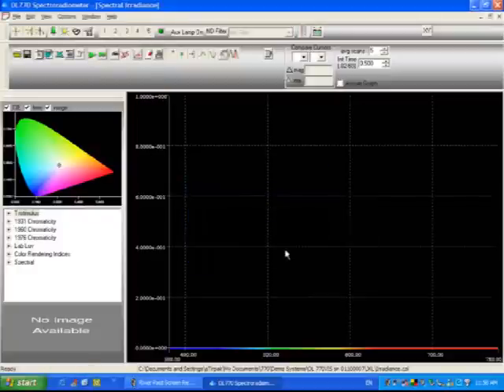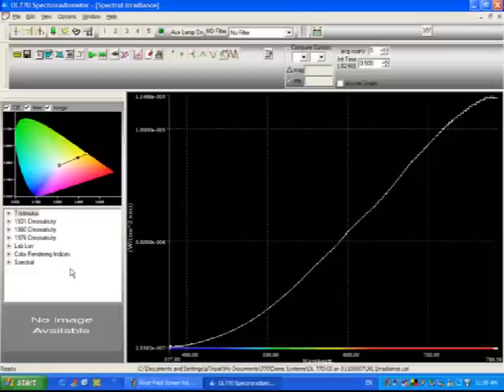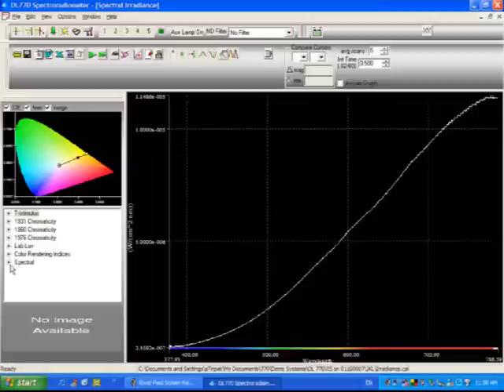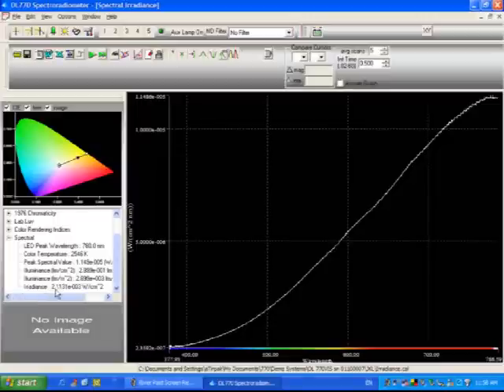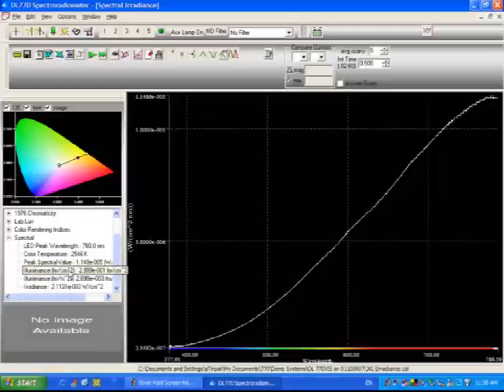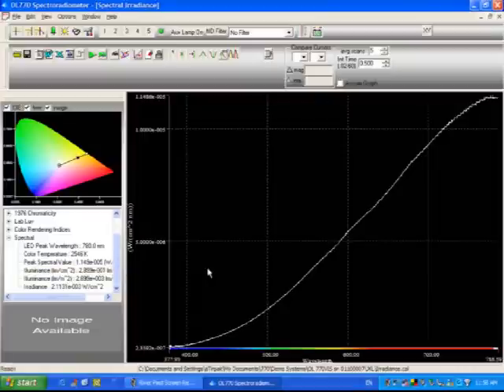We're going to get the same plot as we got before. It's the same lamp. We want to get our value tree up over here. We look under spectral, we get our irradiance values, which is about two milliwatts per centimeter squared. We also get our illuminance values, both in lumens per centimeter squared and lumens per meter squared. That's all there is to taking an irradiance measurement.